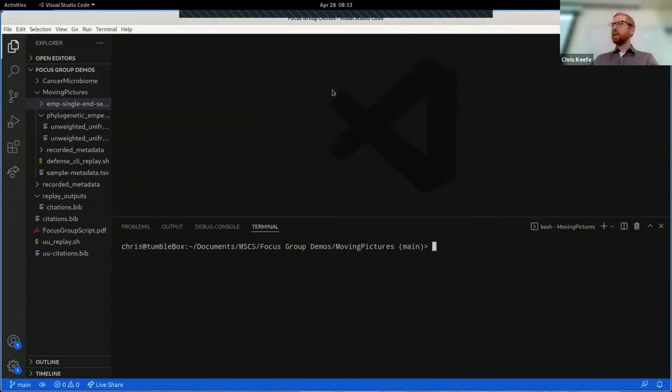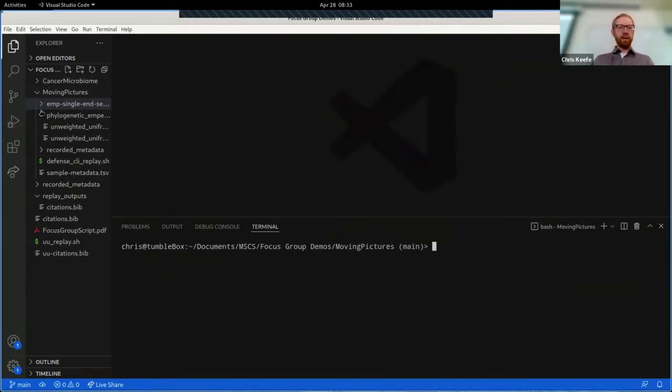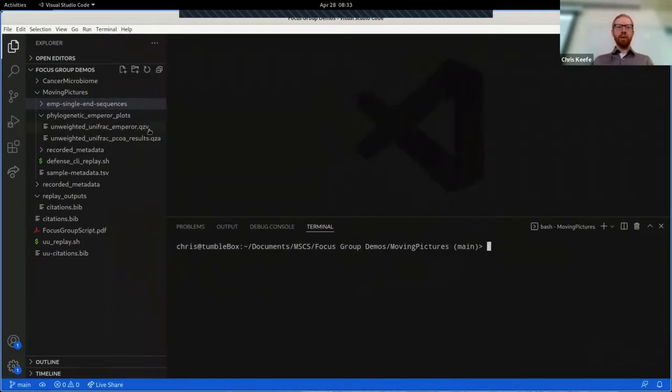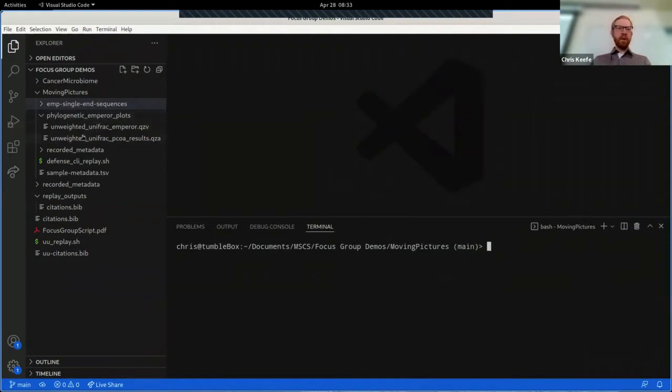This is just a text editor. It lets us see a few things on the left side of the screen. It lets us see the same files that we were looking at in that file browser. So inside of this phylogenetic emperor plots folder, you see that same qzv that we just viewed in QIIME 2 view.